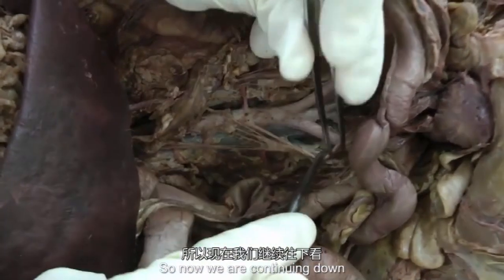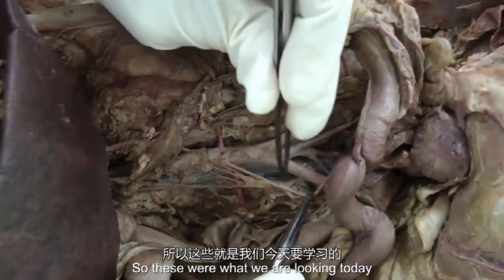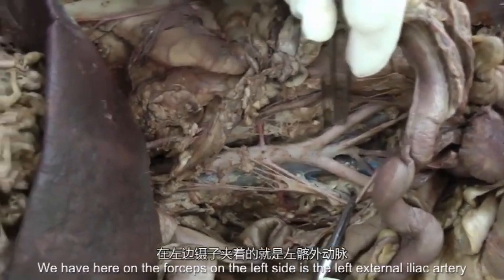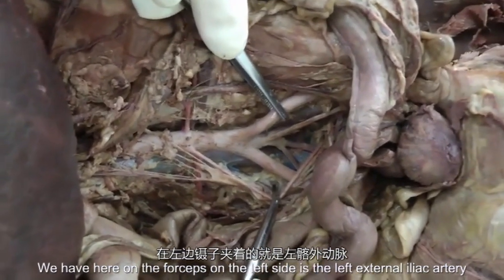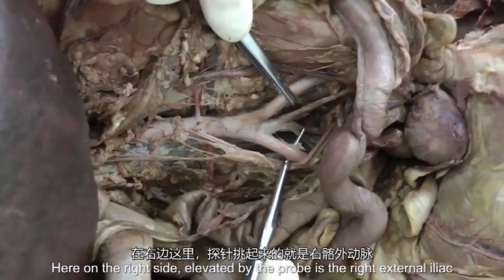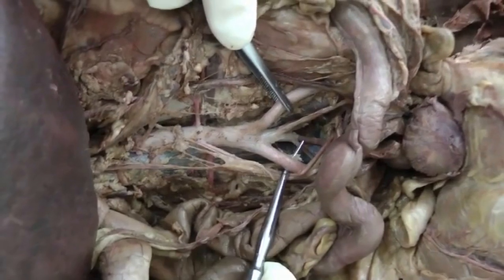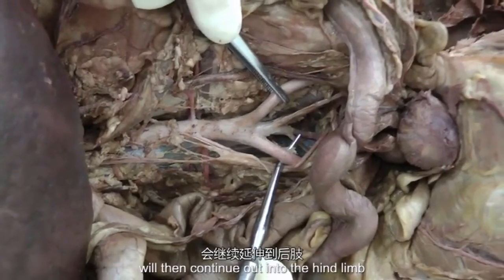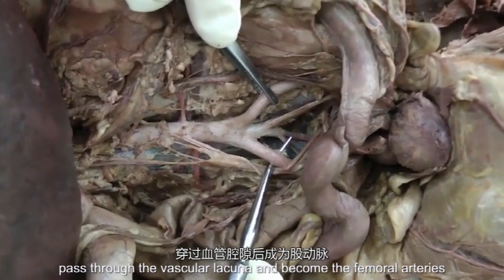Now we're continuing down to where you see all of these branches coming off. These are what we're looking at today. In the forceps on the left side is the left external iliac artery. Here on the right side, elevated by the probe, is the right external iliac. The external iliacs will then continue out into the hind limbs.